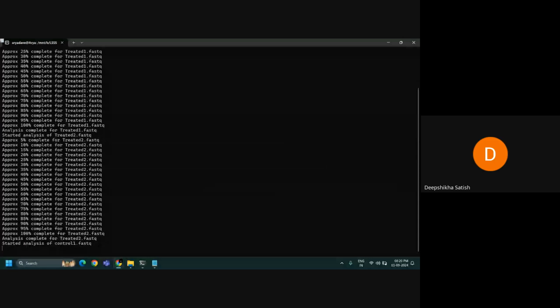And make sure all of the commands you write, you write them in that pipeline only, okay? Because in future, if you want the reference, you can just see that.